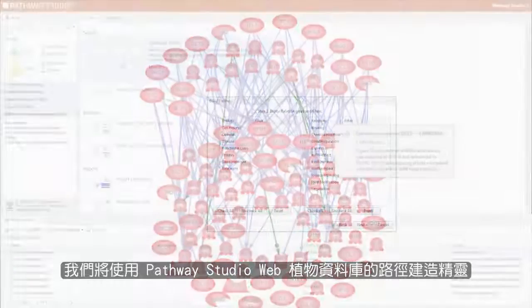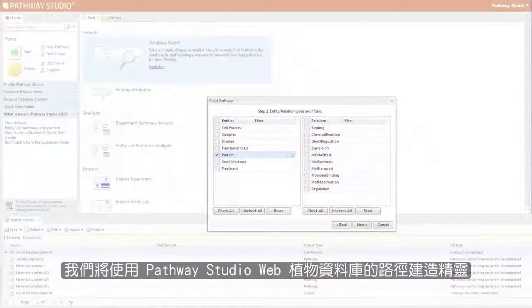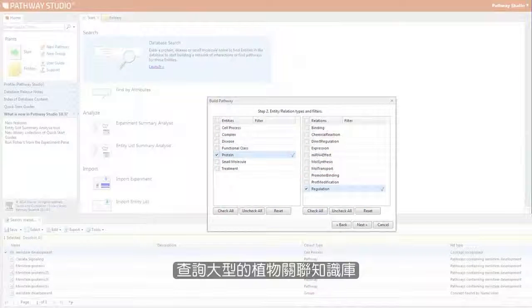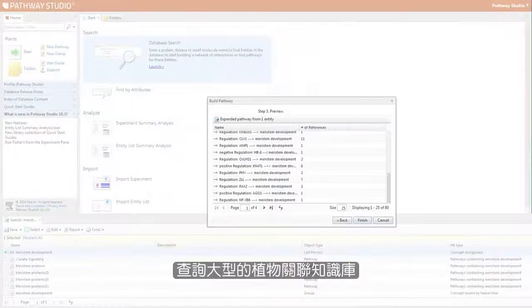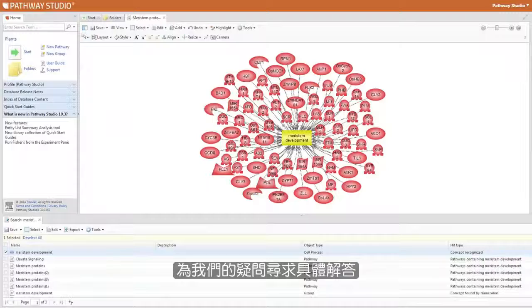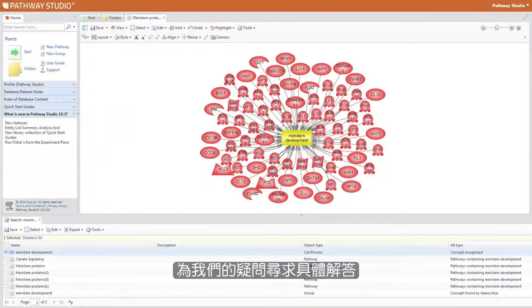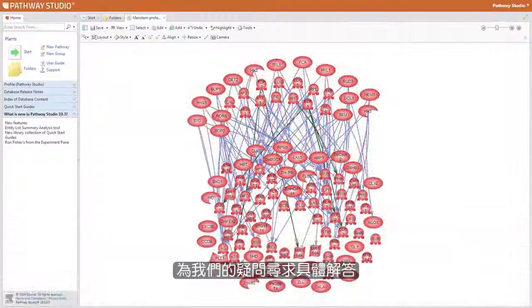We will use the Build Pathway Wizard in Pathway Studio Web Plant to query the large plant relationship knowledge base to find specific answers to our research questions.